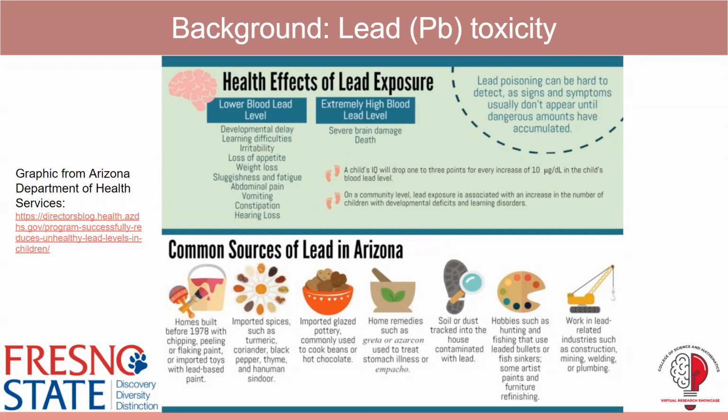We're interested in using L shell XRF to detect lead because it is well known to be a very toxic element to humans and living things. This graphic from the Arizona Department of Health Services is just giving you some broad examples of this. Even though in America we've reduced a lot of our exposure to lead in the previous common sources such as paint in older homes or in glazed pottery and things like that, it still is a danger in other places where you have mining or different construction activities going on, maybe in countries that don't have as strong regulations.